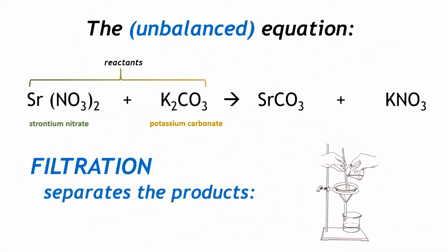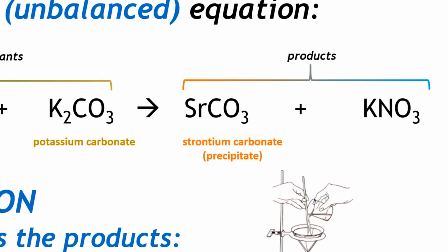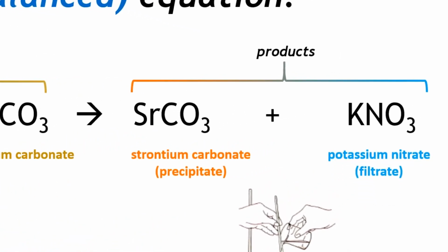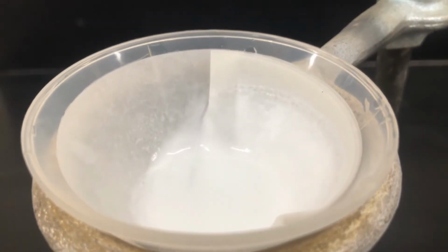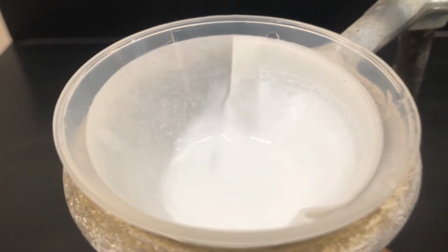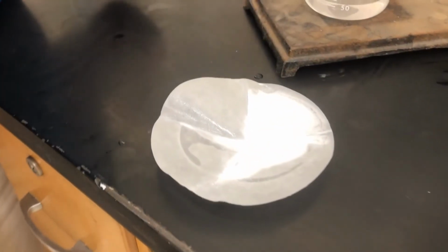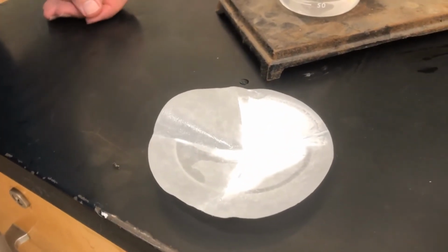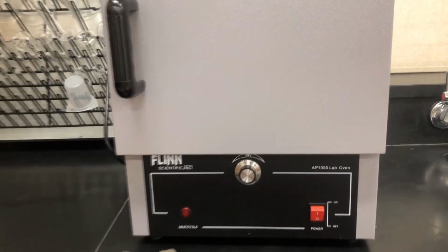Filtration separates the products. One of the products is the filtrate, which goes right through. The other is the precipitate strontium carbonate, and it's being captured by the filter paper. So one substance goes through the filter, but here you see the strontium carbonate being captured. When we remove it, we can see that the filter paper is still very moist, and so there's a great deal of water that is not desired.